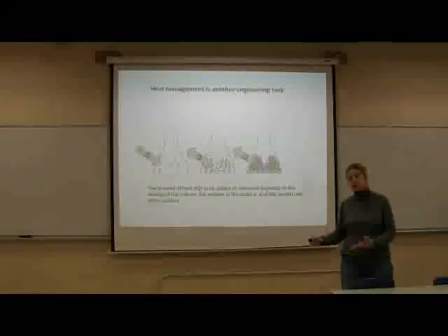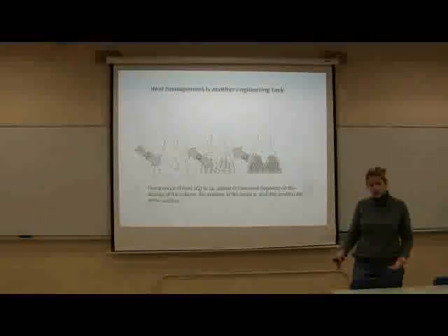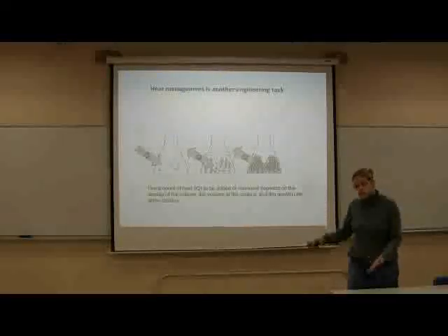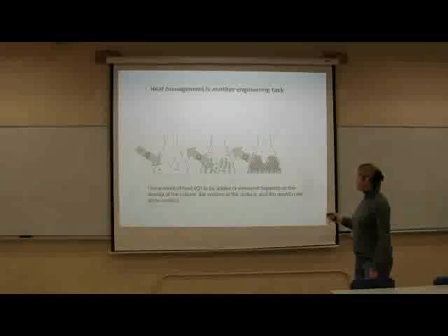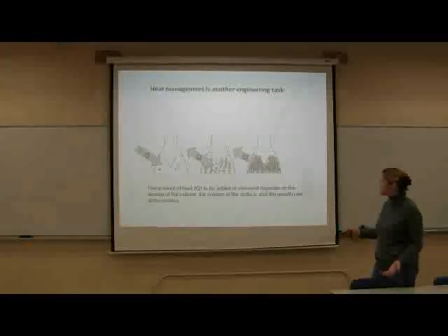Basically, they're combusting the glucose that you feed them. So they're taking glucose and oxygen, and they're converting that to CO2 and water, just like combustion. So they have their own little internal combustion engine to keep themselves working, and they give off heat as a result. So they're very efficient, but they do give off some heat. And so you got to take care of them, or they will cook themselves to death. So that's an important one for us to manage.